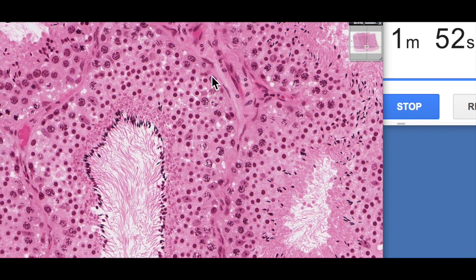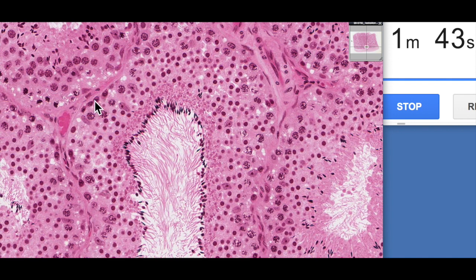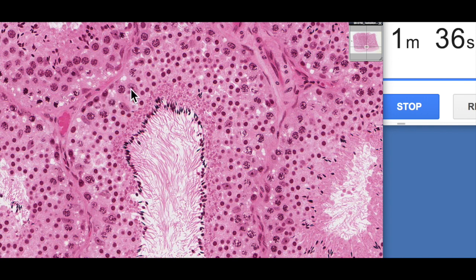Sitting on the basement membrane, we have these round nuclei — these are the spermatogonia. You can see them sitting on the basement membrane here. The spermatogonia undergo mitosis: one stays behind as a stem cell, and one then pushes past the blood-testis barrier, which is formed between tight junctions between adjacent Sertoli cells.